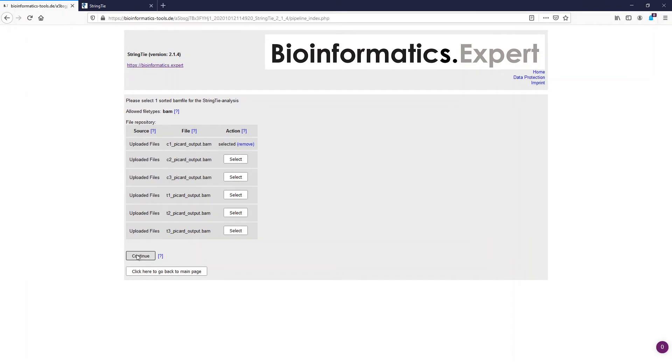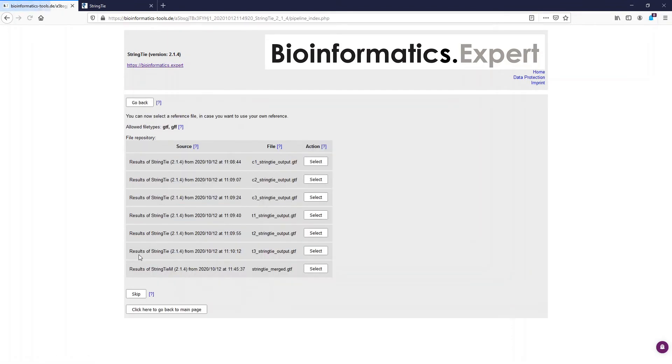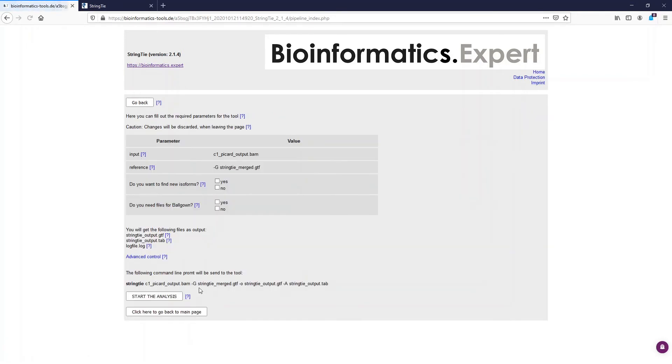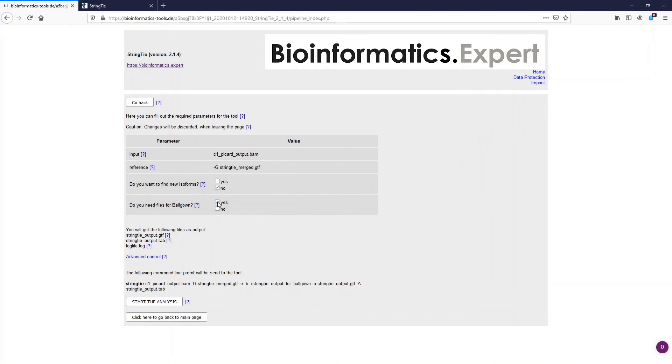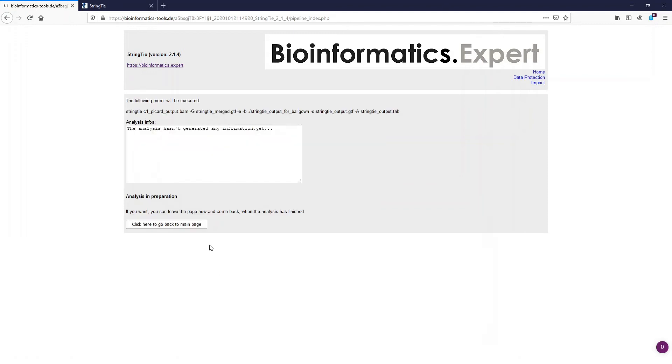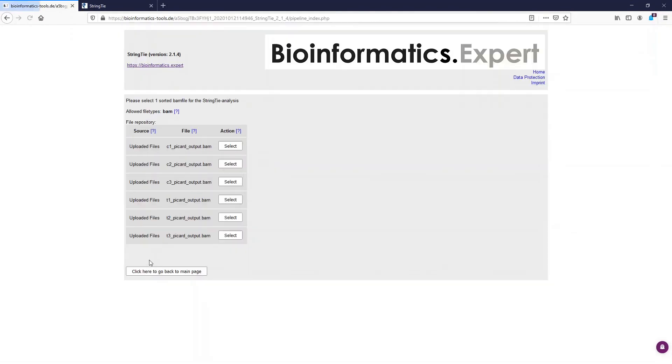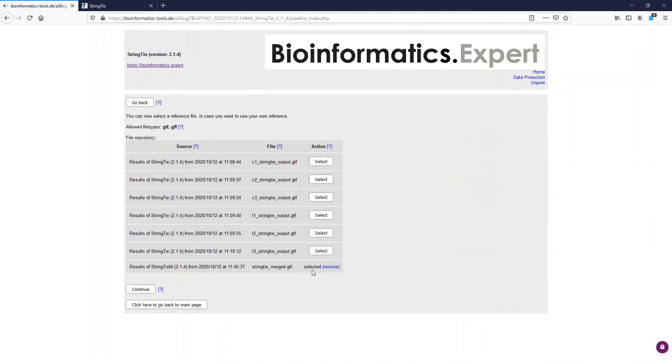After we have selected the BAM file we now have to select the merged reference file. In the parameter table select no on the first question and select yes on the second question because we need the files for the Ballgown analysis. Now we can start the analysis. And with the same parameters we can also start the StringTie runs for the other samples.